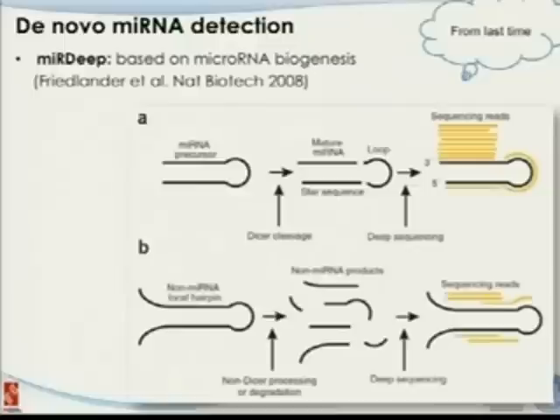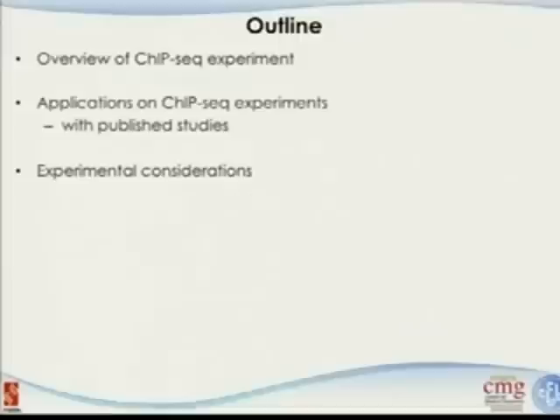Both of these were mentioned earlier. But now you are using additional information, which is the Dicer digestion and the pattern you're supposed to look at. And this will give you better specificity when you identify the variants, identify the novel microRNAs.